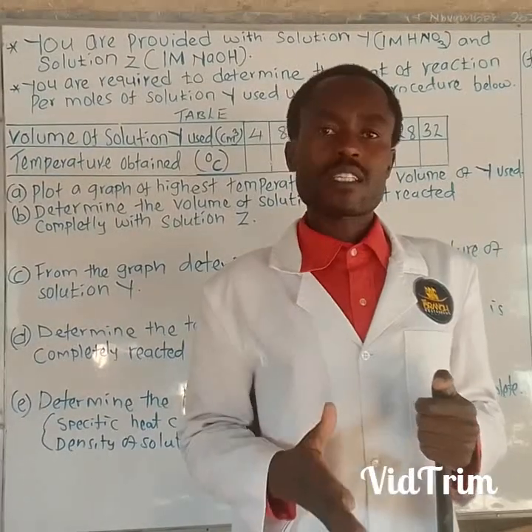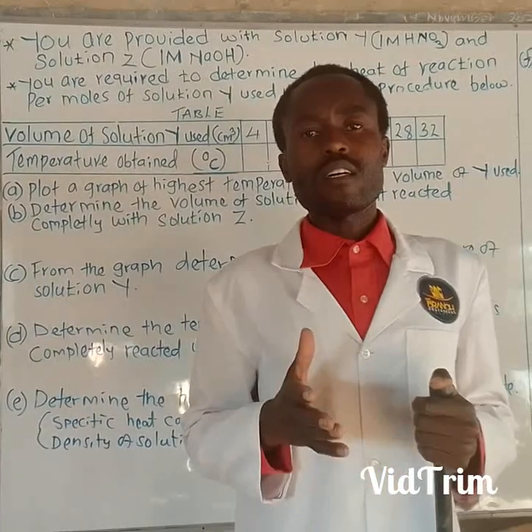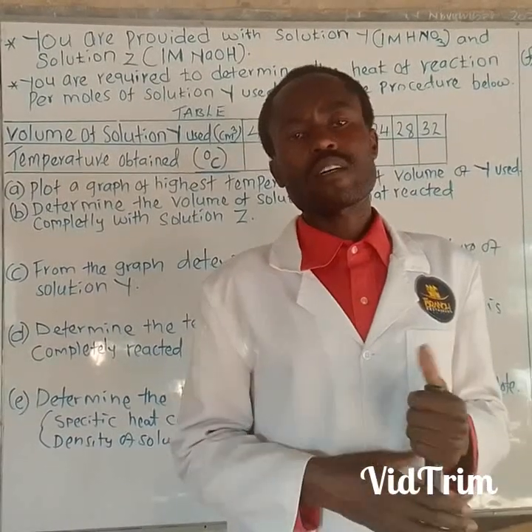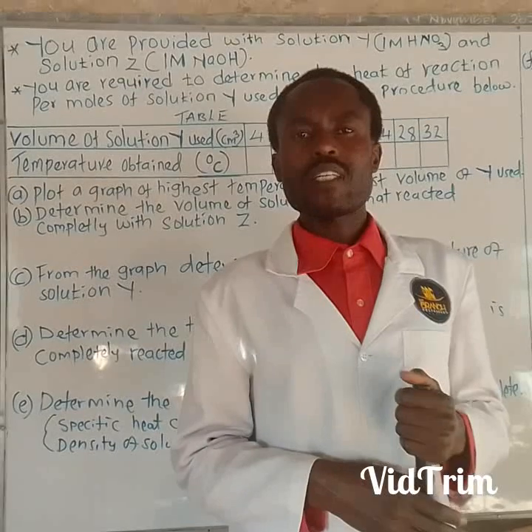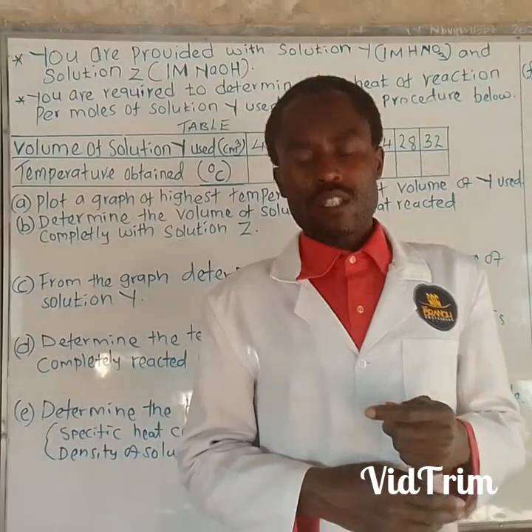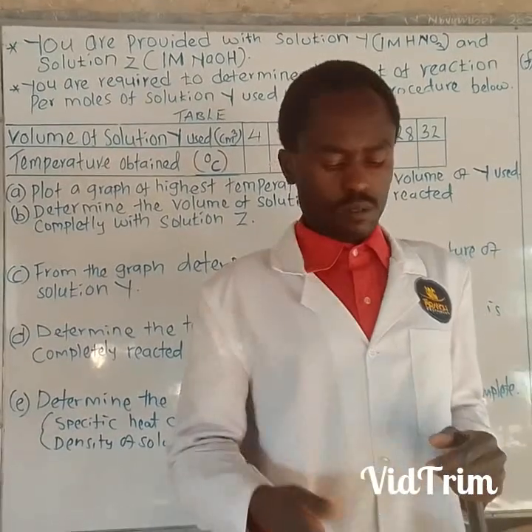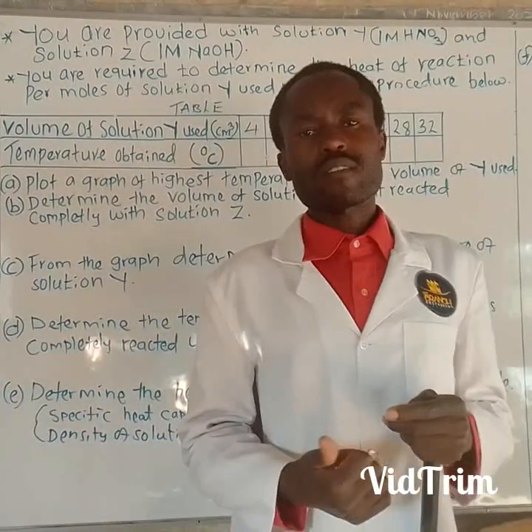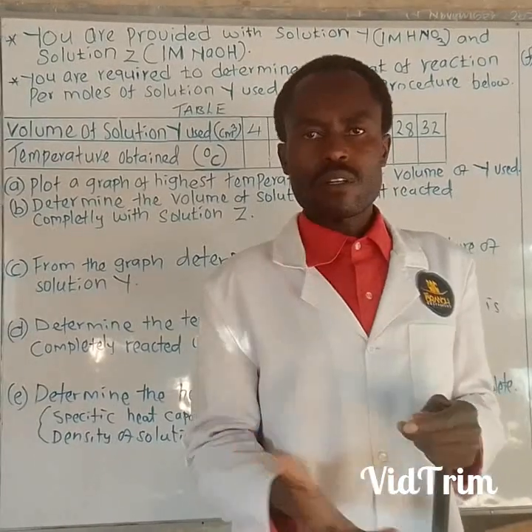So in this experiment, I'm going to use a KCSE sample question to determine the heat of a reaction. Is it okay? In 1 minute, let me take you through the chemical reagents I have. Then we look straight away at a sample question.